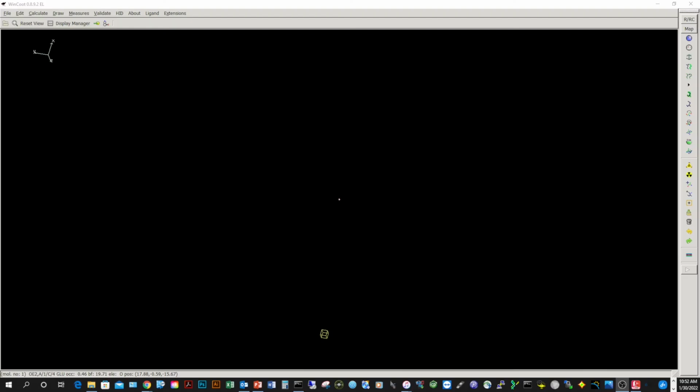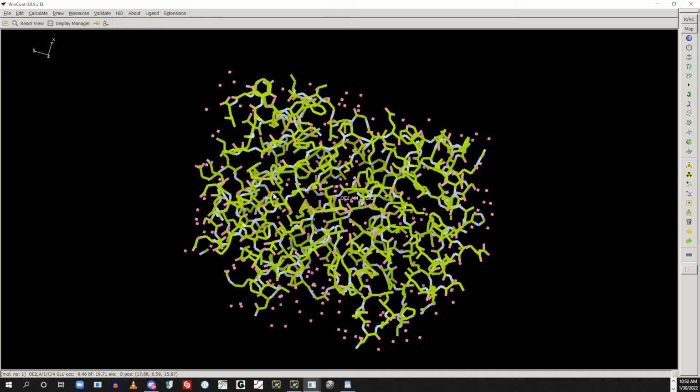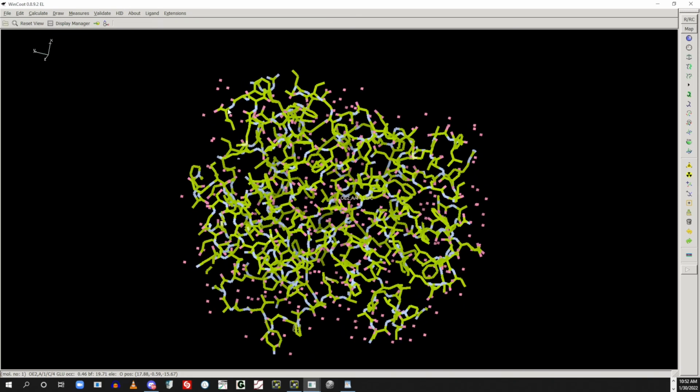All right, now I'm going to switch software so I can show the electron density maps. What we see here is the chemical structure of that same protein we were just looking at, which is a trimer. I can rotate it around, and we can see the chemical structure of all the side chains. We can also see these red atoms here. Those represent water molecules. Water molecules are part of a crystal structure as they're bound by hydrogen bonds. And of course, they have electron density, just as a protein does, and essentially any atom.